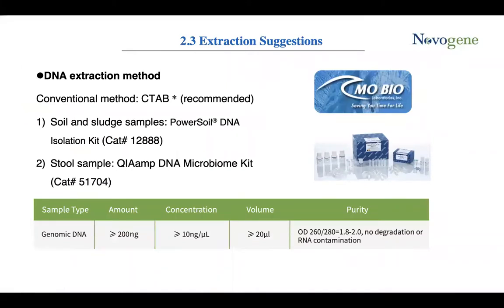And after we completed sample preparation, the next step will be the DNA extraction. And here we have some extraction method recommendations regarding different kinds of sample sources based on our project experiences. And one of the most extensively adopted extraction methods is using CTAB solution, since the polysaccharides and the DNA have different solubilities in CTAB depending on the concentration of sodium chloride.